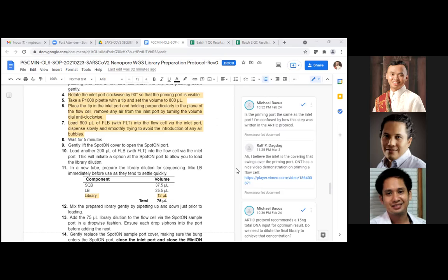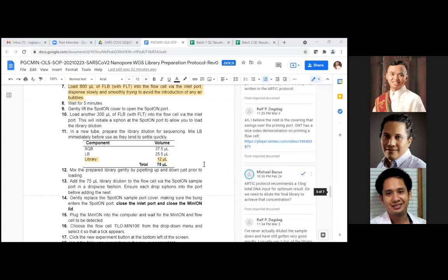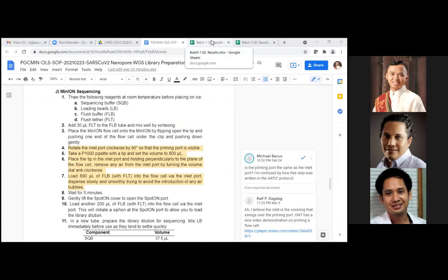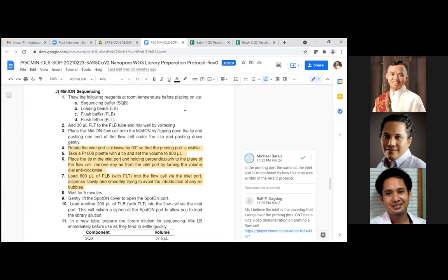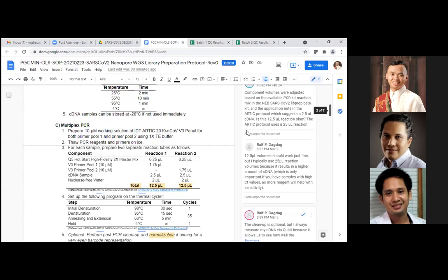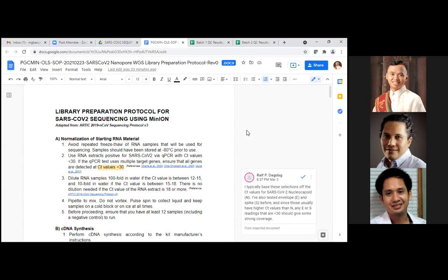What else can we share? Do you have any specific questions, Stephen, in terms of the process? I would probably want to ask how many lab personnel is involved in executing all these protocols. Okay. So I think 2 personnel is sufficient, 1 lead and 1 assistant.